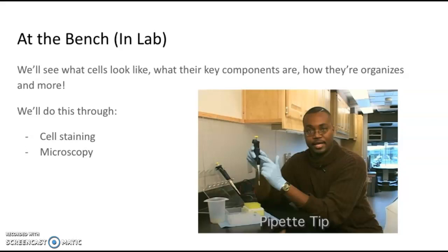Now, I'll go over with you some of the basics of a microscope, but to me it's kind of like learning how to use an iPhone, right? You don't necessarily look at the lab manual to figure it out. You just kind of start playing with it and you'll figure it out. But we'll go over that together when you're actually at the bench, like how to use these light microscopes.